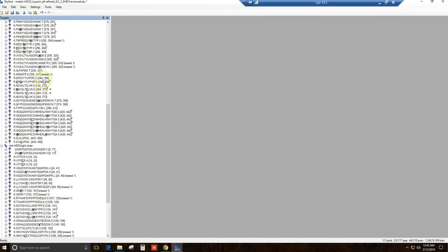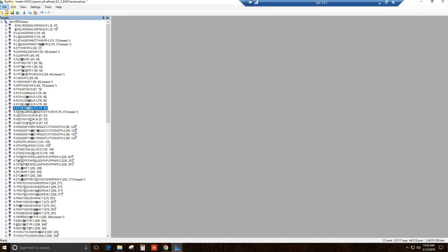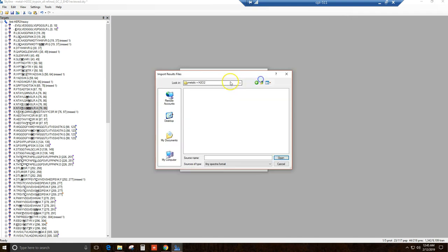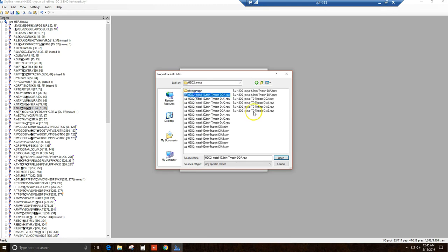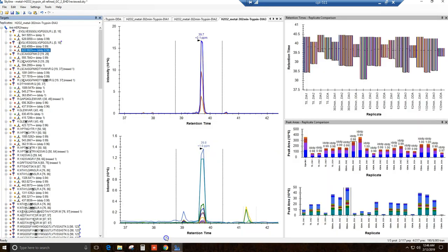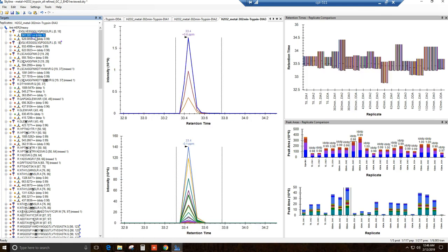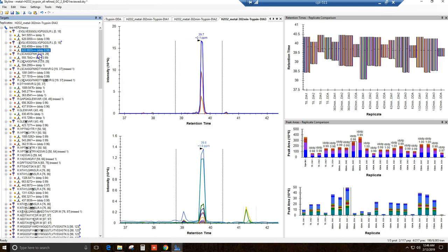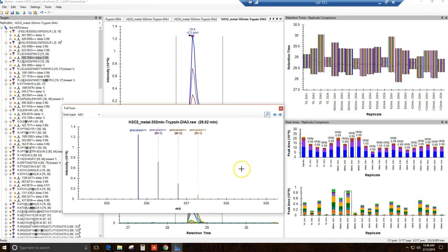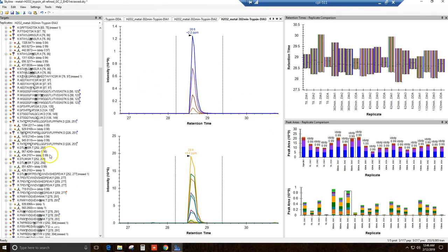With the help of the templates, we can consistently monitor every modification site. We can go to File, Import, then click Results, and navigate our way to the results. Users could batch process and search modifications of the entire stability raw data. Thanks to Skyline, the data import will take about 15 minutes, so let us open a Skyline file that is already imported. We can see mass transitions of each peptide, and the well-aligned precursor and product LCMS peaks. All transitions in the templates have been carefully selected. Please refer to the manuscript for our criteria on deselecting and mitigating false positive identifications.